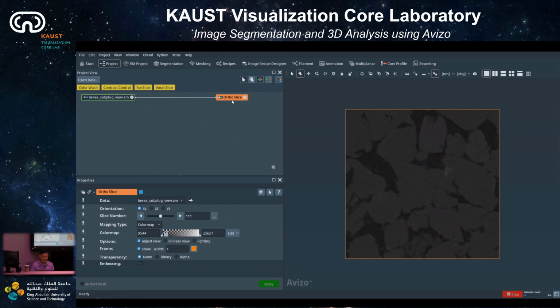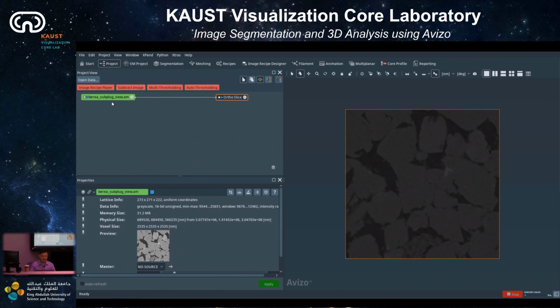If you see orange, that indicates 2D visualization. Later, when we do 3D visualization by attaching a new module, you will see that it turns to yellow. And if you click on the dataset, the original grayscale, it becomes green, or even the label image green. And if you apply some computation, it's going to be red because it's a computing module.